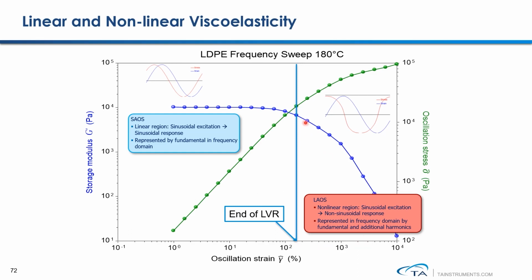the measured modulus shows a significant drop, and the stress curve deviates more and more from the straight-line relationship. As you monitor from the point graph, the output stress signal is not showing a sinusoidal waveform anymore, but exhibits a very weird shape. This area is outside the linear viscoelastic region of your sample, which means with this large amplitude oscillation, you have already irreversibly changed the structure of the material.